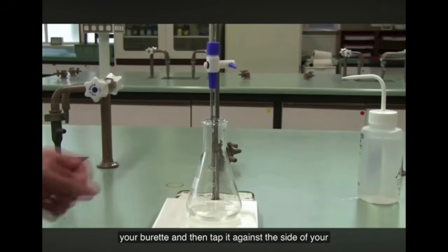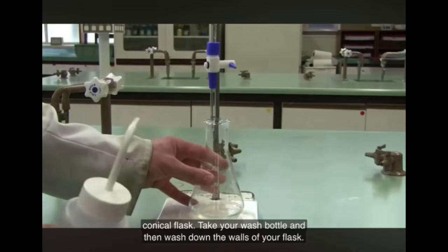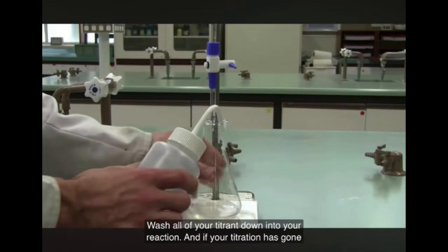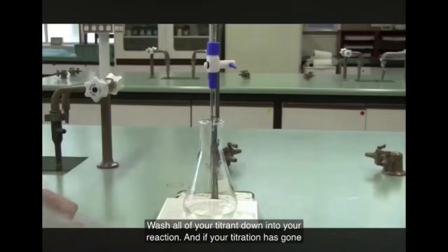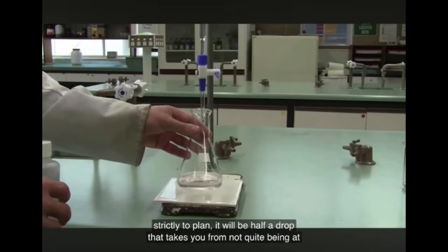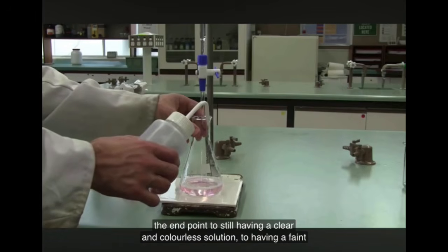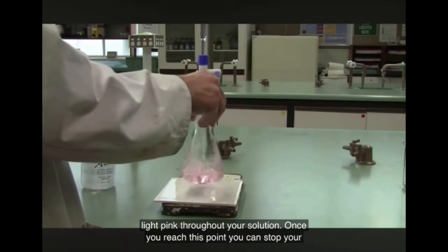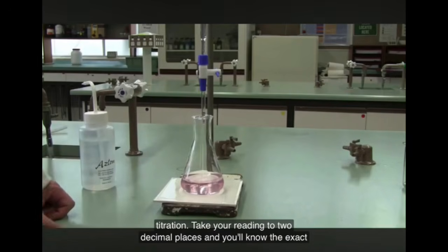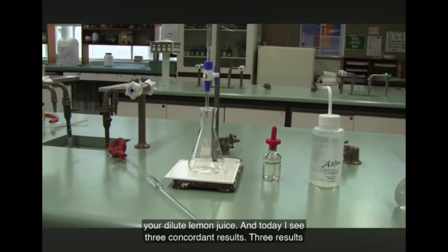And then tap it against the side of your conical flask. Take your wash bottle and then wash down the walls of your flask. Wash all of your titrant down into your reaction. And if your titration has gone strictly to plan, it will be half a drop that takes you from not quite being at the end point, with a clear and colorless solution, to having a faint light pink throughout your solution. Once you reach this point, you can stop your titration, take your reading to 2 decimal places, and you'll know the exact volume of sodium hydroxide required to react with 20 ml of your dilute lemon juice.